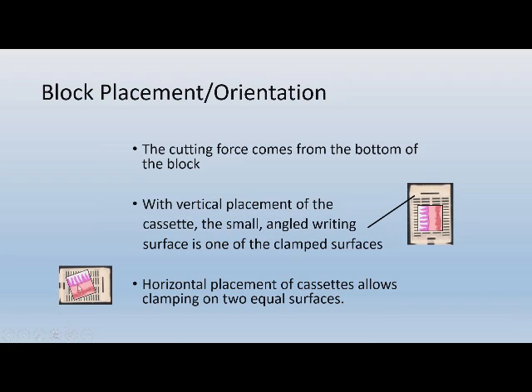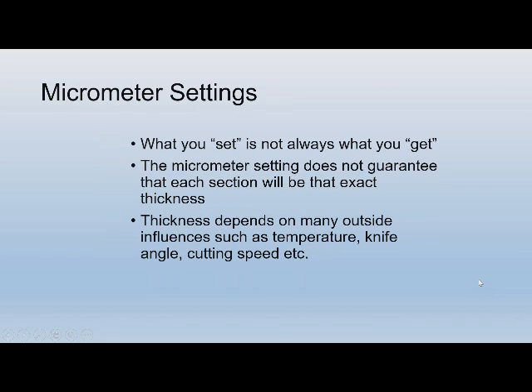Now you would say, instead of turning it this way, if we go back to our suggested way of embedding this, we can still use it this way, still get the plane of least resistance as we think we're getting right here.